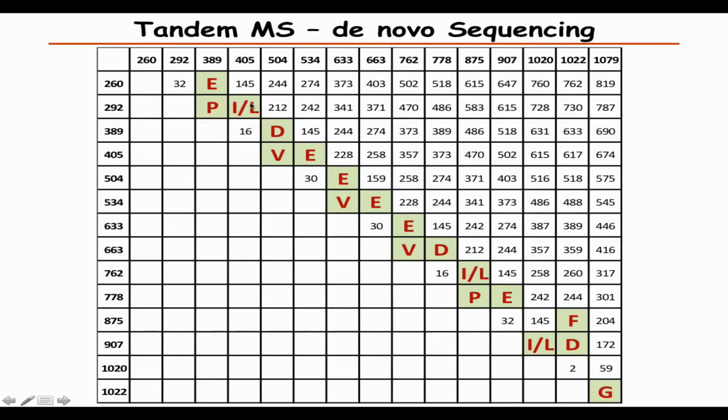So we usually won't be able to tell the difference. Sometimes if you do some quite esoteric higher energy collisions, you can get different fragmentation patterns, but almost no one does that because it's too complicated.